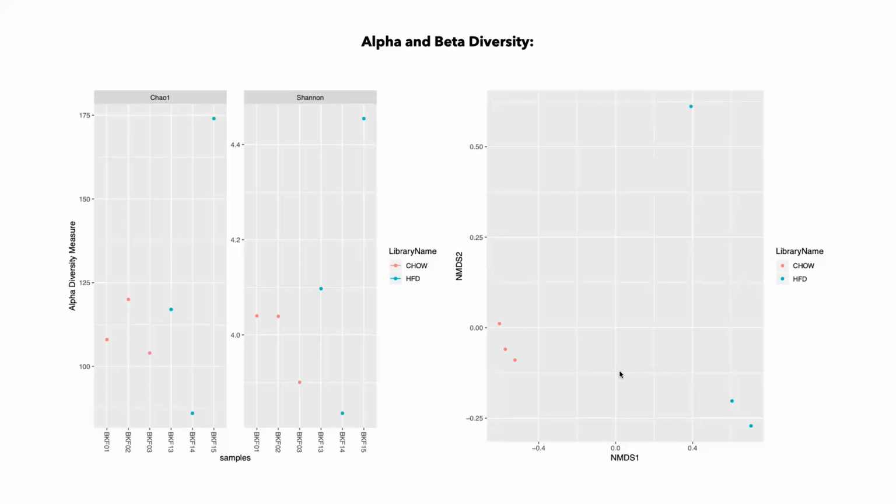And between all samples will show you how diversity of colors, or diversity of bacteria in this example, separates your samples. Okay, so here are samples, each one has 3 colors, and these have 5 colors each. Okay, so that tells you, maybe those that have 5 or 4 or 6 are all going to be here in this corner, and those that have 3, 2, or 1 are going to be here. Okay, so that gives you that measurement.